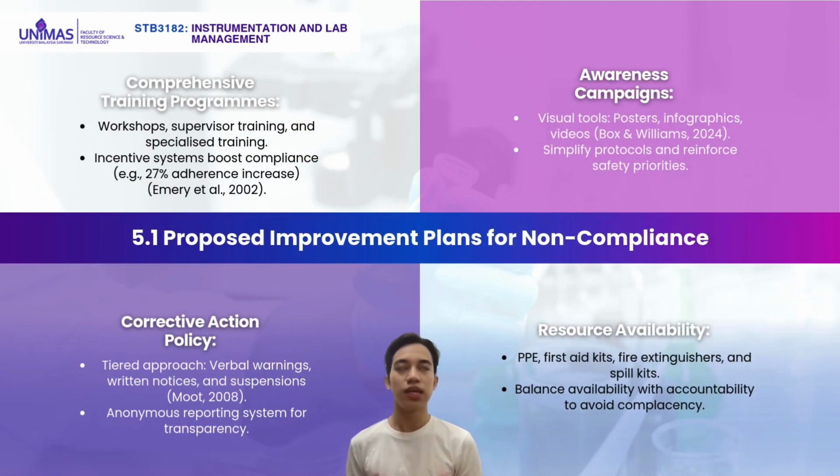Next, we move to the improvement plans for non-compliance. Non-compliance with safety protocols in clinical laboratories poses serious risks. To address this, we propose improvement measures to foster a culture of safety, enhance adherence, and equip personnel with essential resources. First, comprehensive training programs and workshops are key. Specialized training has been shown to increase compliance rates from 62 to over 90%, and incentive systems further boost adherence, with one program achieving a 27% improvement.